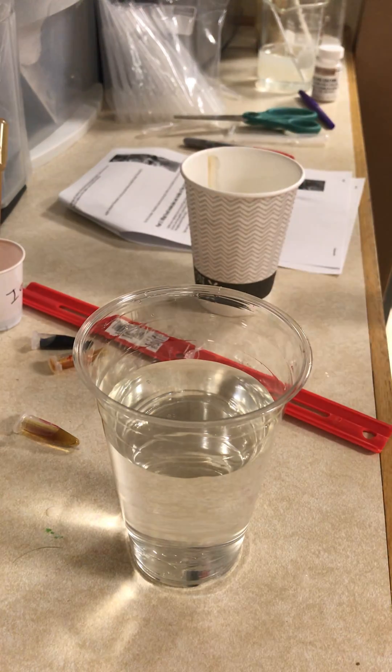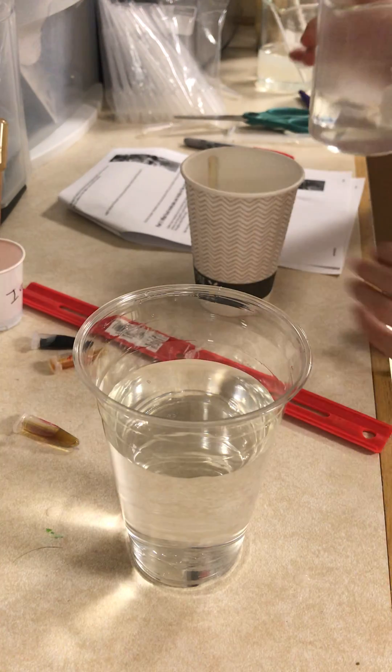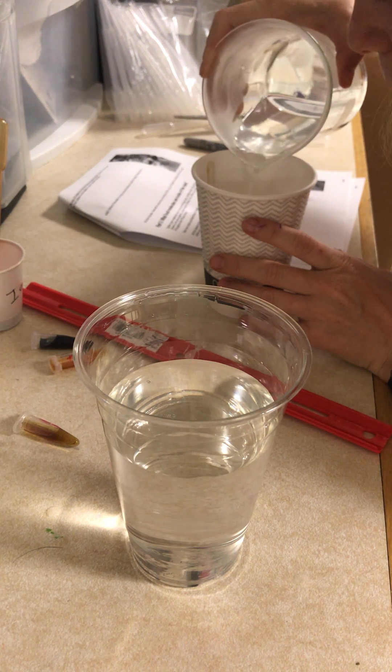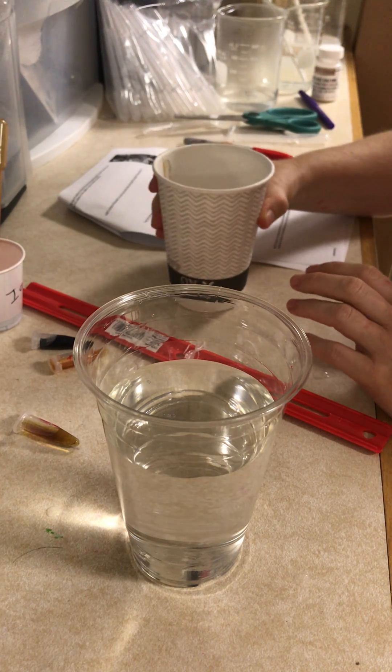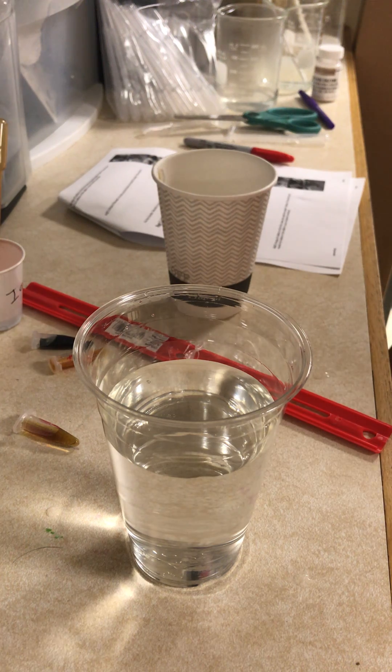Now I'm going to get hot water from either a hot water heater or a tea kettle and add that hot water to cover the tubes. This water needs to be really close to boiling and the tubes are going to need to sit in here for five minutes. I'm going to swirl it around a little bit and leave it there for five minutes.